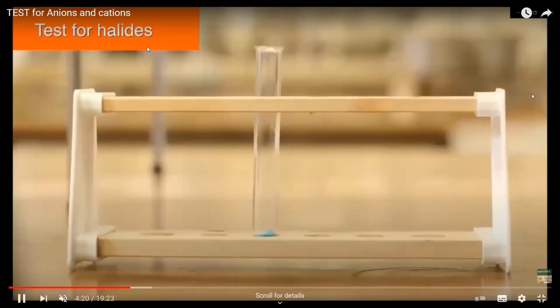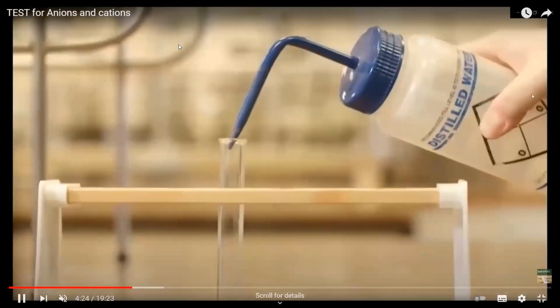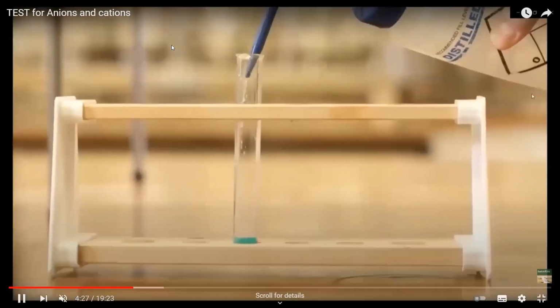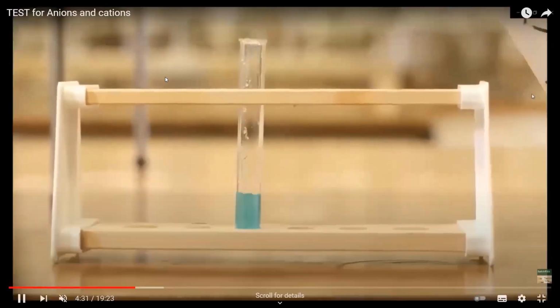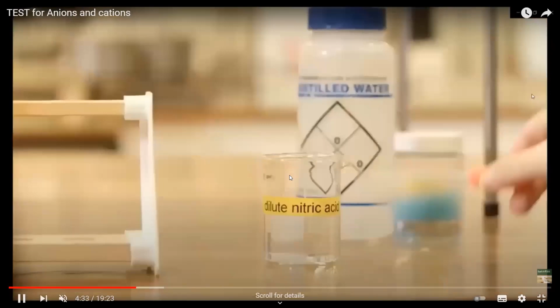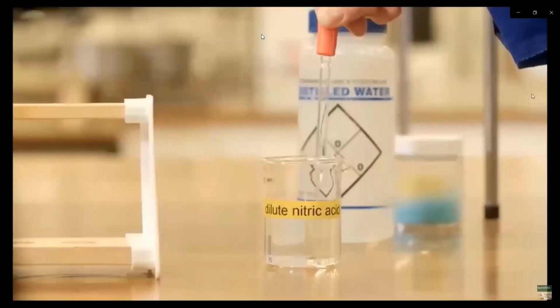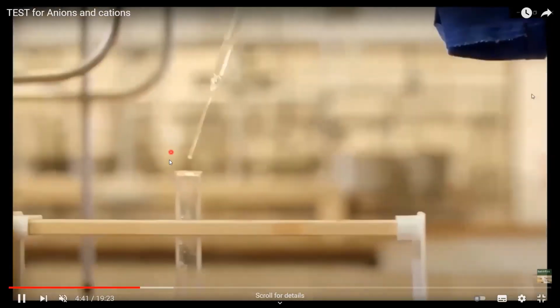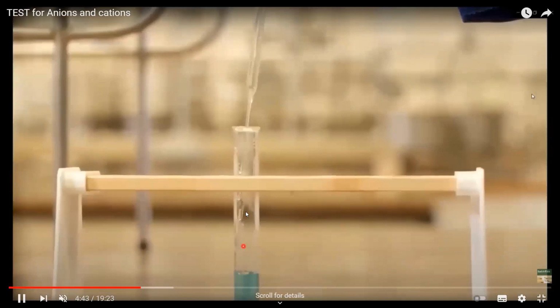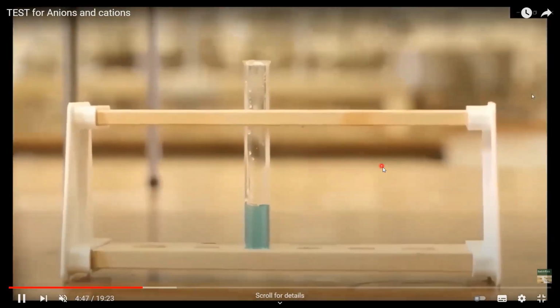So if we want to test a halide ion, first we make a solution, using distilled water, a salt solution. We don't know which halide is there. So first we add nitric acid. As you can see, we are adding nitric acid using a dropper or a teat pipette, and this nitric acid is followed by silver nitrate.